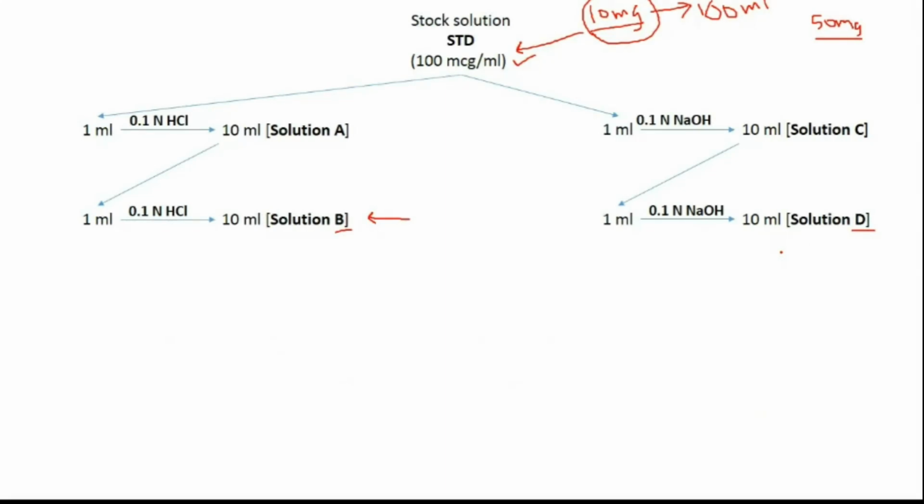You will take down this dilution scheme, and once you have taken it down, everybody will calculate the concentration of B and the concentration of D, and let me know in the chat box what the concentration is. Do that concentration calculation on the last page of the rough journal. In the continuation, just write the dilution scheme. Okay. Please calculate concentration of B and D and tell me in the chat box.